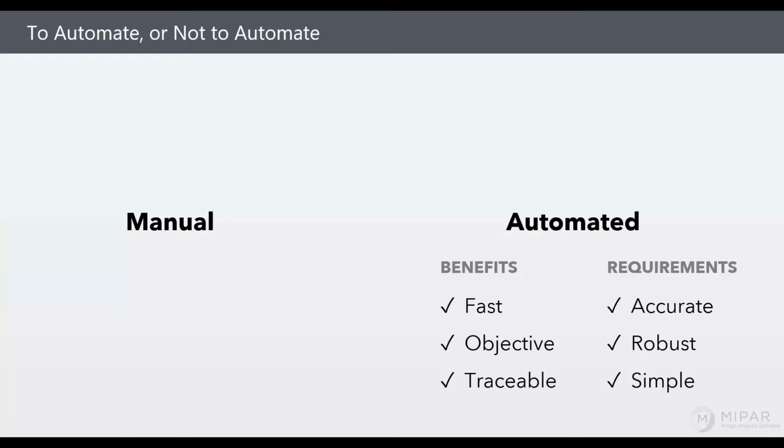Almost always, we need a solution in an automated sense that is as accurate or better as what we've been doing by hand. That solution can't just work for one image or one condition. It's got to handle at least a reasonable level of lighting, exposure, and sample prep variation, and it can't require a computer science expert to put the solution together and maintain it. It's got to be something that folks that have been characterizing samples historically can move into and develop a solution that can be used throughout an organization.